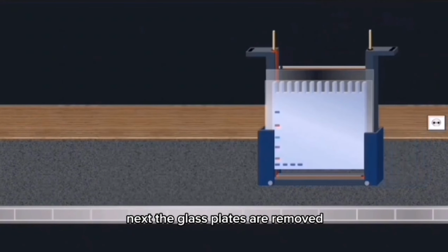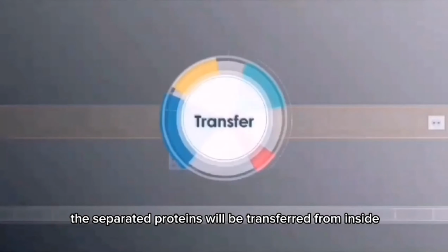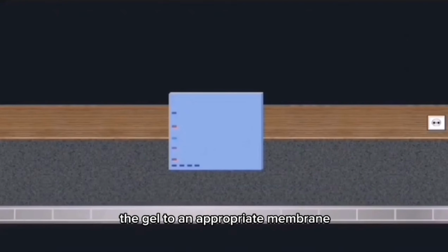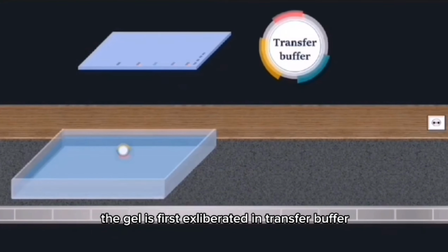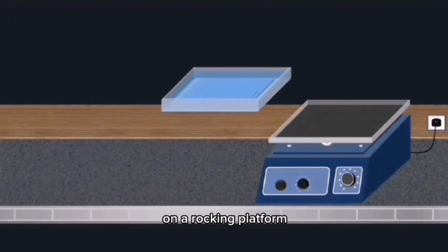Next, the glass plates are removed, and the top portion containing the wells is cut off from the gel. In the next step, the separated proteins will be transferred from inside the gel to an appropriate membrane. When performing a wet transfer, the gel is first equilibrated in transfer buffer, so it is placed in a tray with the blotting buffer on a rocking platform.